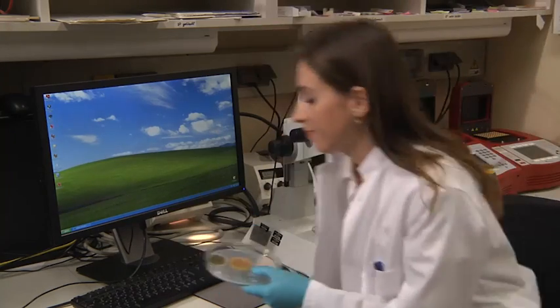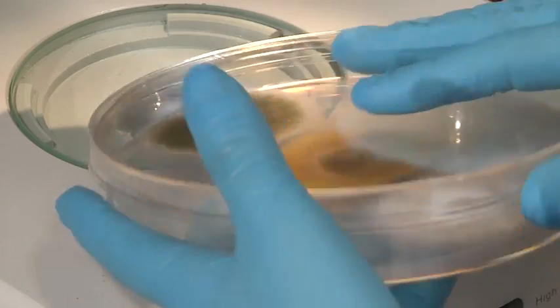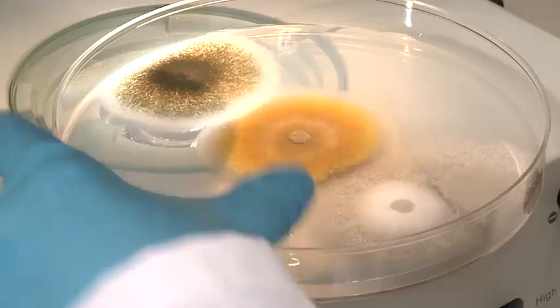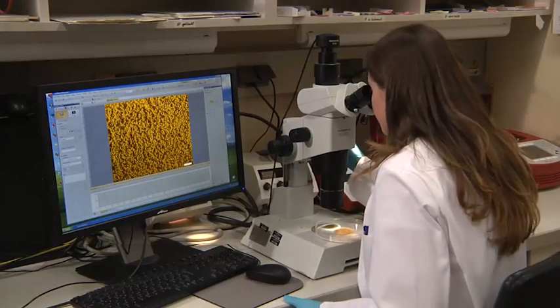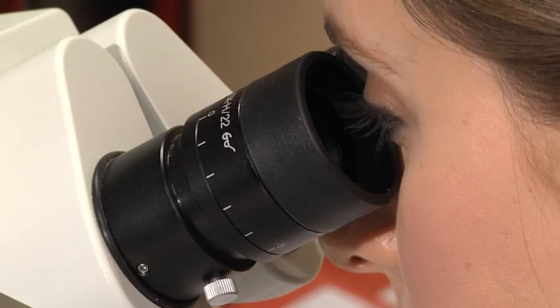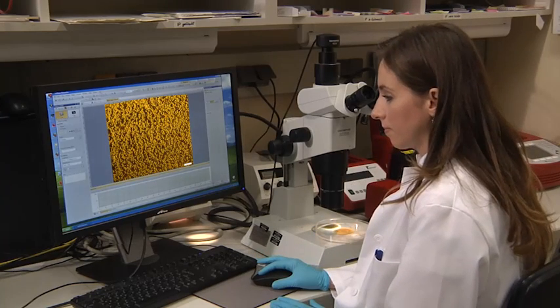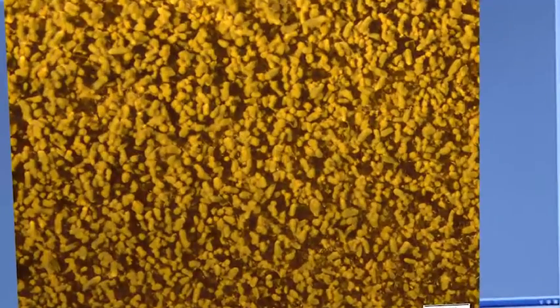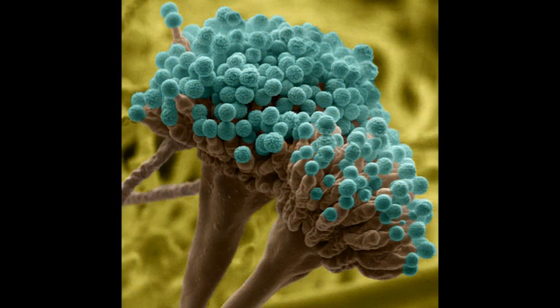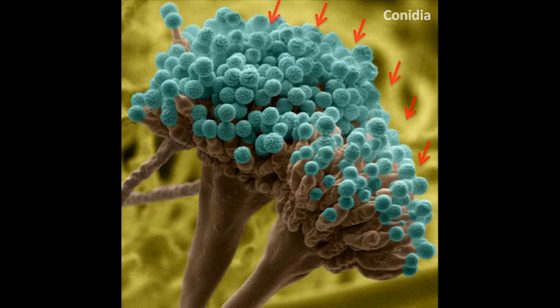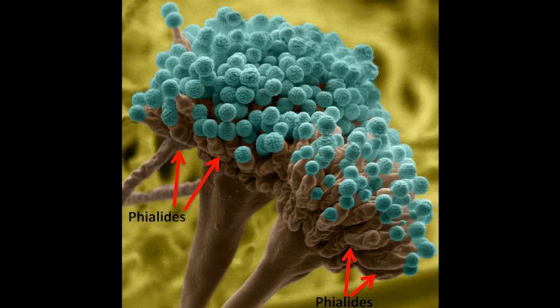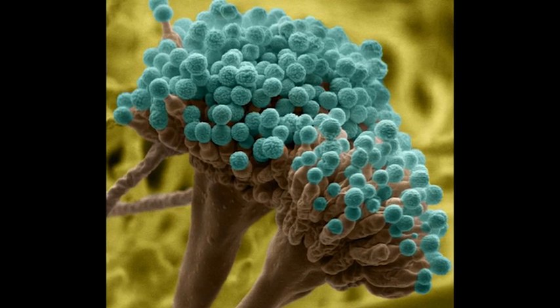With the help of a binocular, we can have a closer look at the fungus. With a magnification of 40 times, it is possible to see some special structures of the fungus. While growing under light conditions, this fungus produces asexual structures called conidiophores, which carry the asexual spores named conidia. Here is a scanning electron microscopy image of a conidiophore. Chains of conidia are produced from finger-like structures called phylides. Accumulation of the green pigment makes them look green.